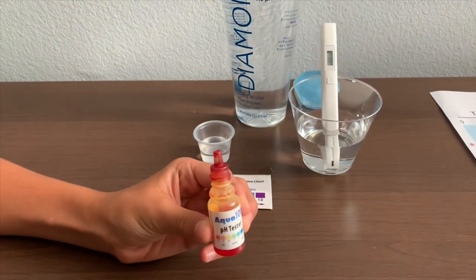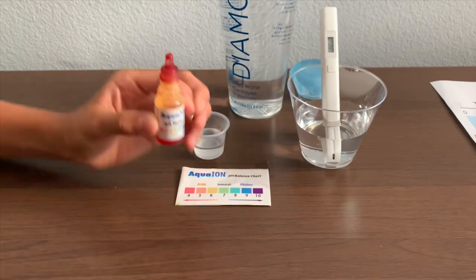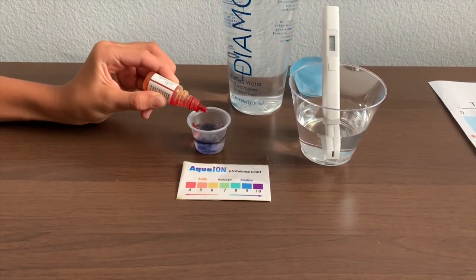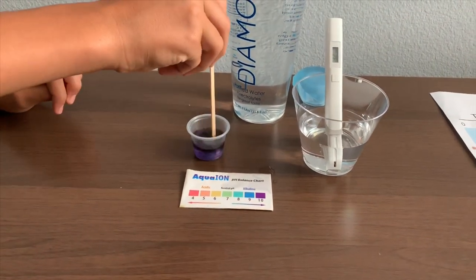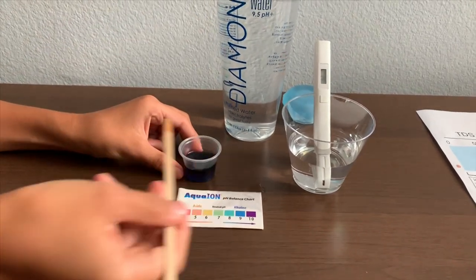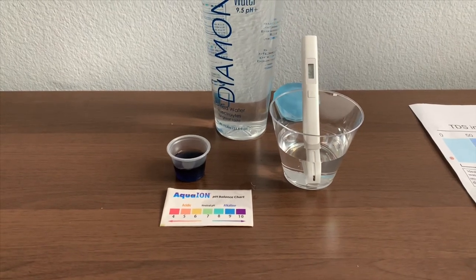Now let's test the pH level. We only need to do 2 drops. And if you want to buy this pH tester, check the link down below. Let's turn it in for a better result. I'll say that's a 10. That is all clean water.